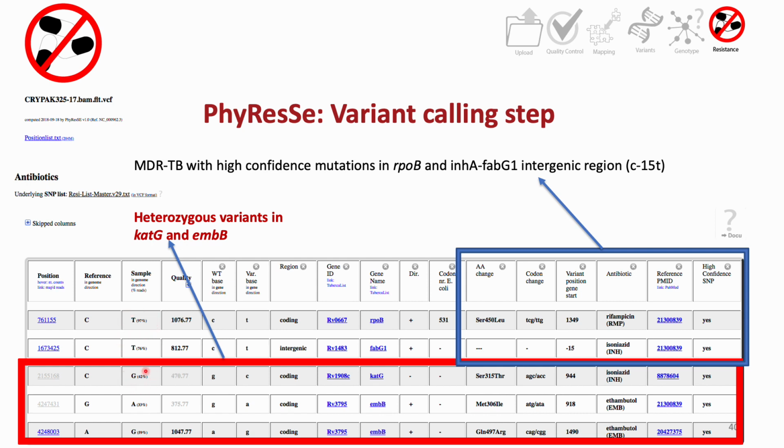So 42% of the population of these bacteria that has been sequenced has this mutation. So we have a heterozygous variant, or a heteroresistance variant, for this gene in our sample.